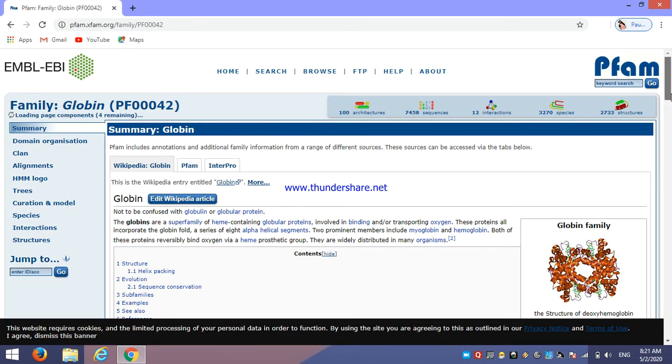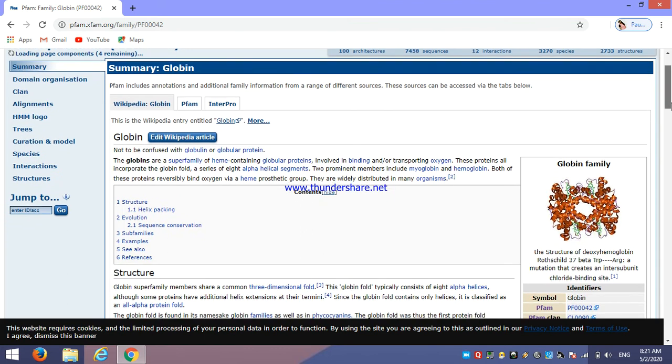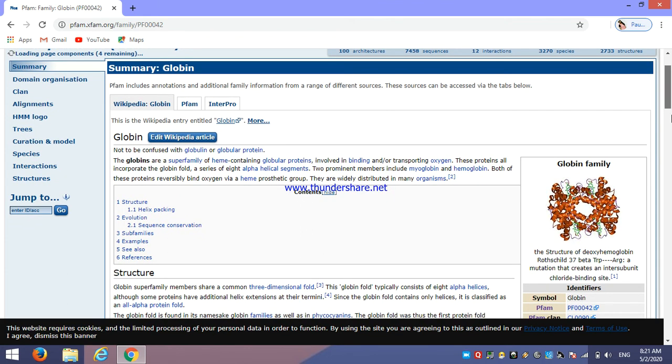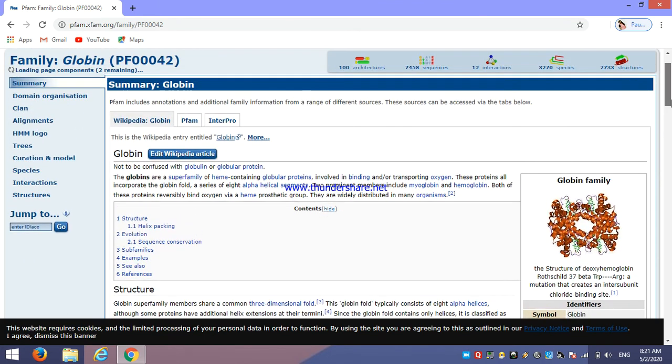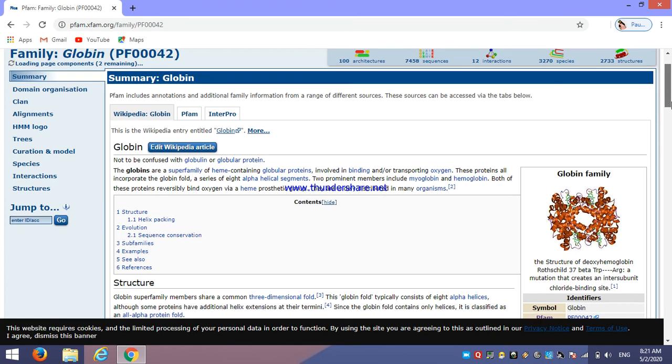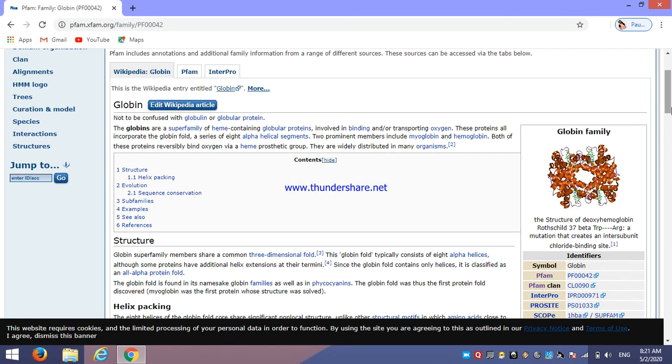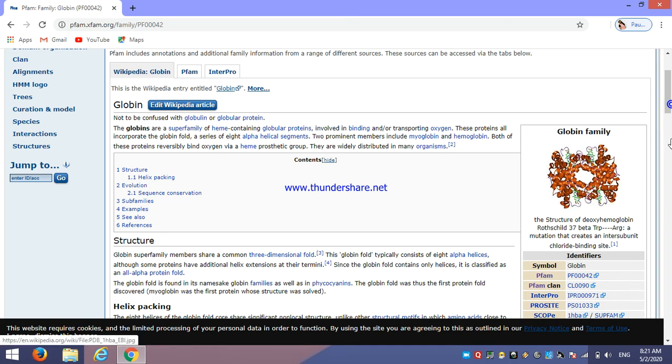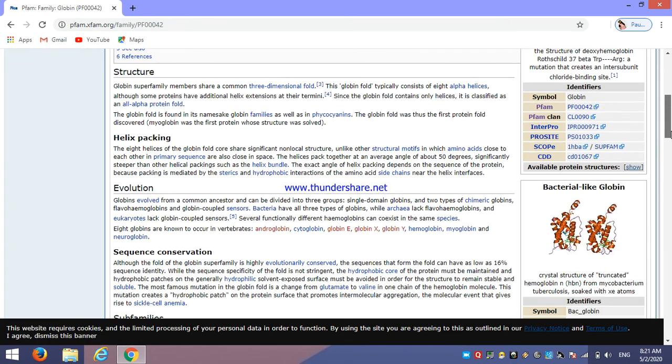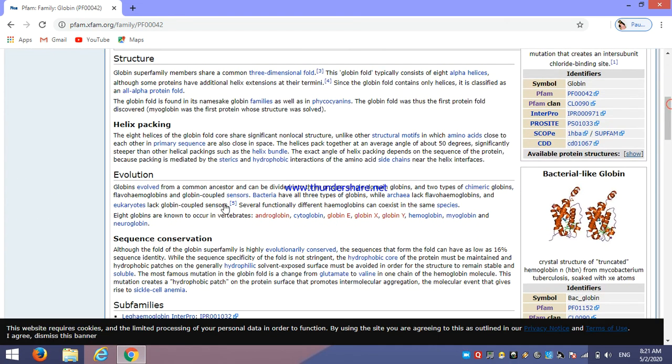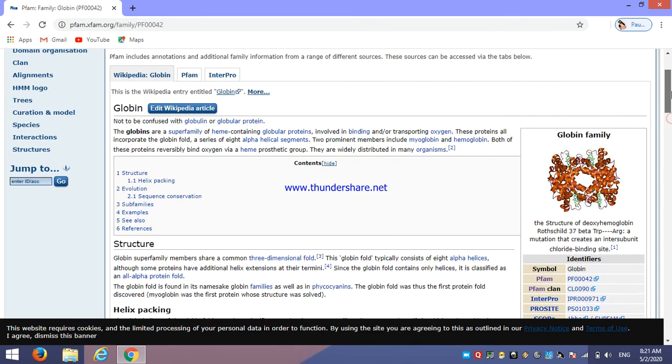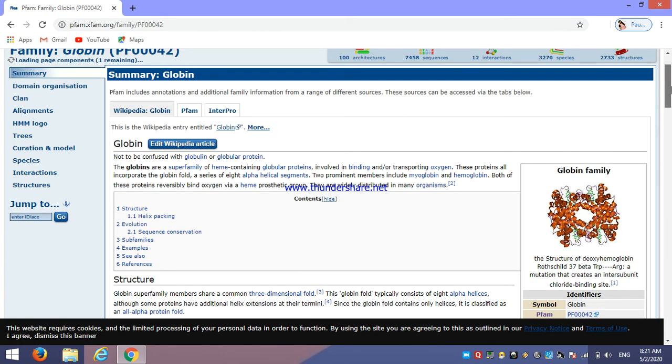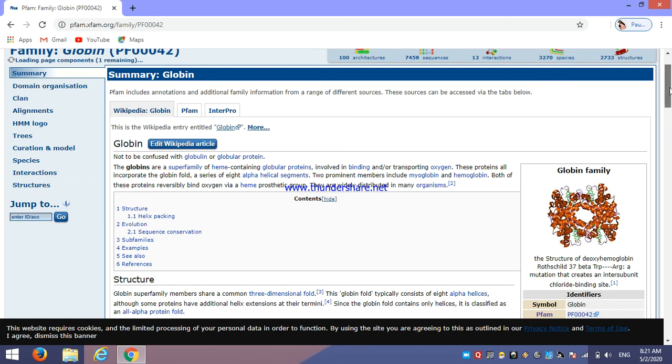Now here we can see, this is the informative part of that particular query or protein family search. Here are the structural information. Then this is structure. Then these are the helix packing or evolutionary information. This is all about Wikipedia information. Also here we can see there are this particular protein or query is present in about 3,270 species.